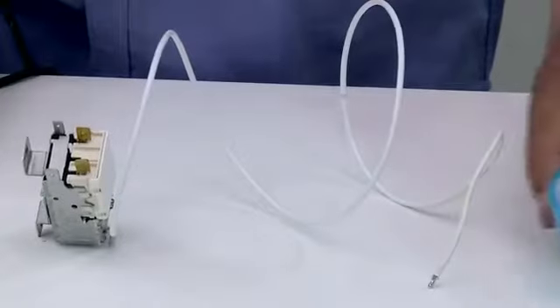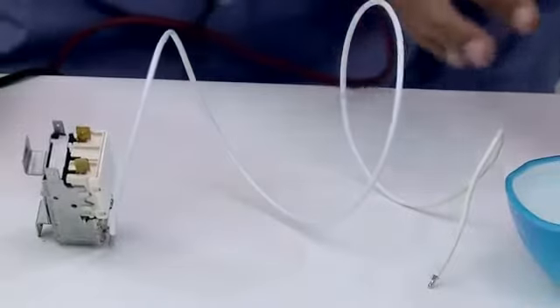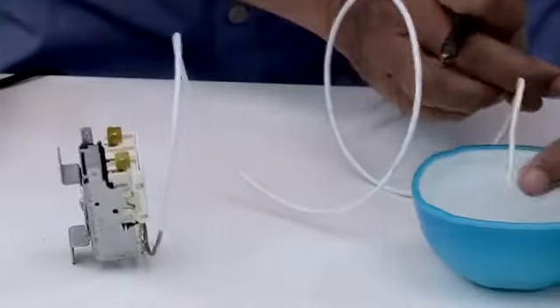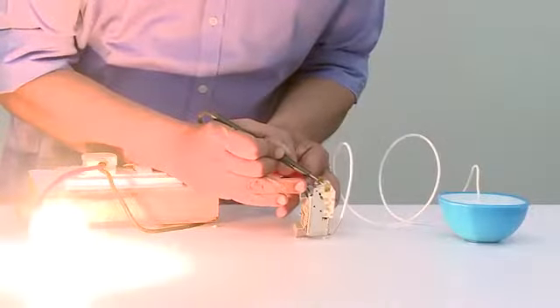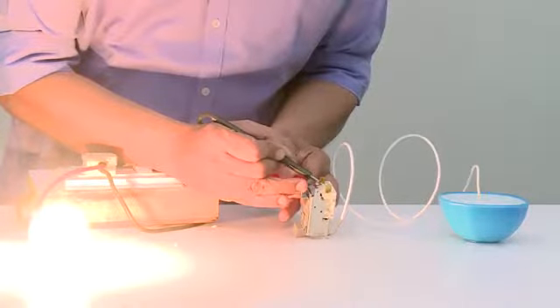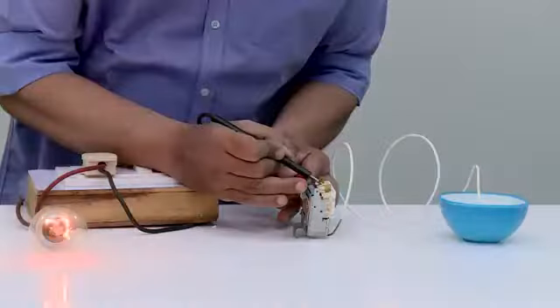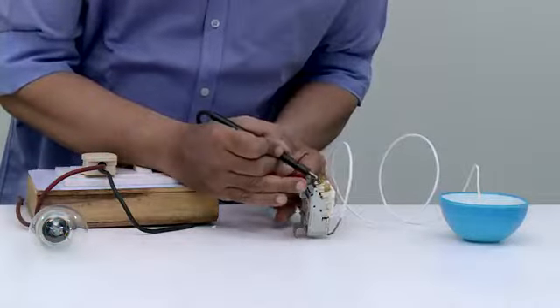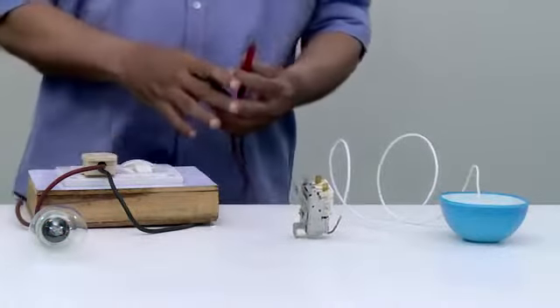We will now check cut-off operation of thermostat by inserting its sensing element into the crushed ice. When the set point temperature is attained, the bulb stops glowing. This shows that the thermostat is in working order.